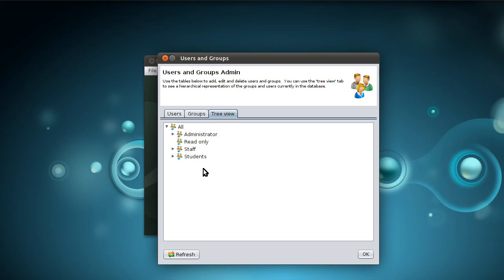Once we've got this fully operational, this will be a really handy way. You can just set the permissions on the students group, and all these permissions will be inherited by the subgroups and all the users within those subgroups. It also means that you will be able to very easily disable an entire group. So with a single click, you'll be able to disable access for all your students from a particular class.